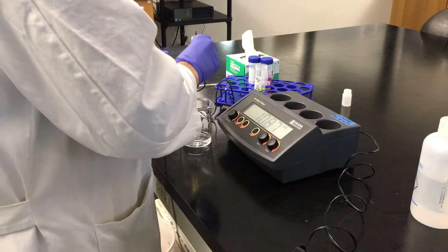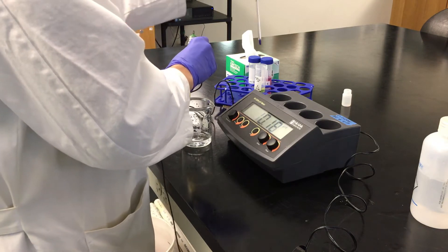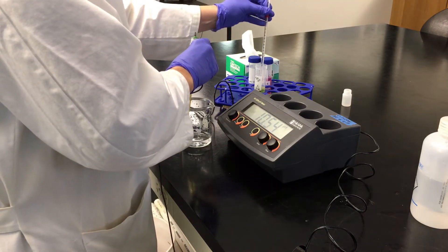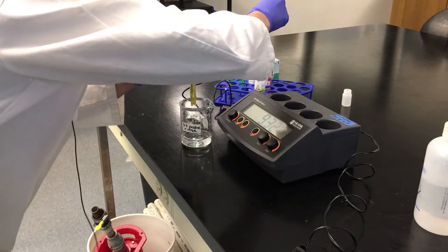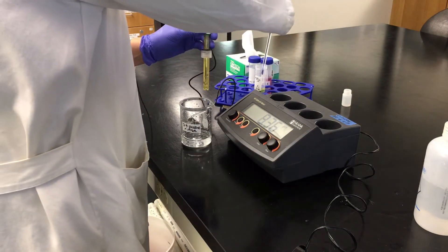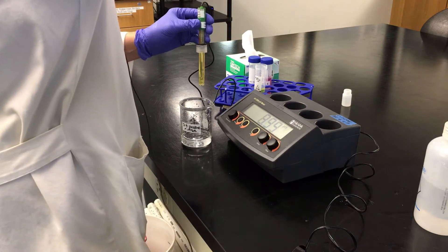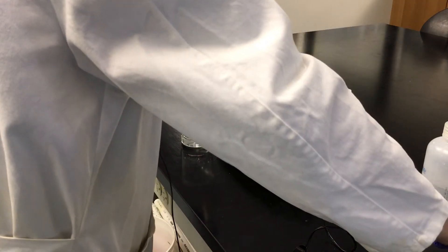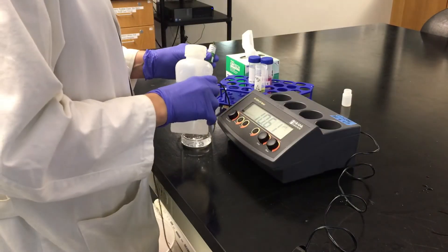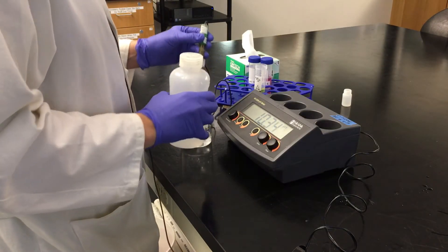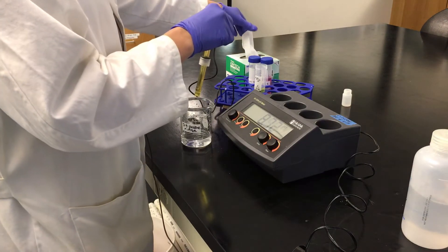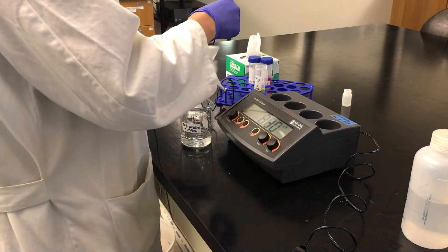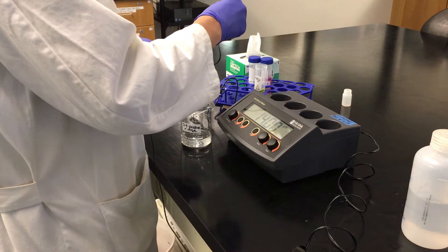So we want to make sure we account for temperature, so we're going to measure the temperature of our pH 7. See that our temperature reading is 20 C. We want to place our probe into the pH 7 standard. I'm going to remove some of that water, and just dab it.